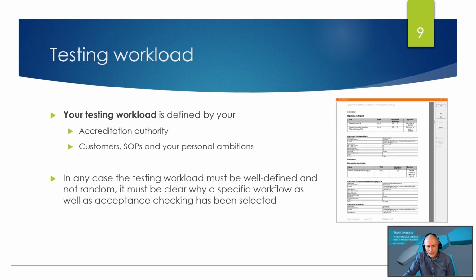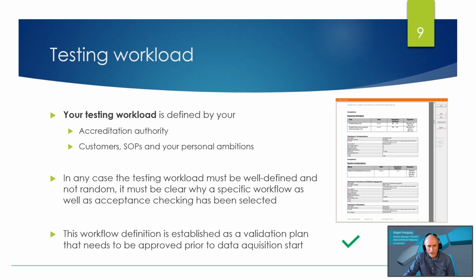In any case, the testing workload must be well defined and not random. It must be clear why a specific workflow as well as acceptance checking has been selected. This workflow definition is established as a validation plan that needs to be approved prior to data acquisition start.